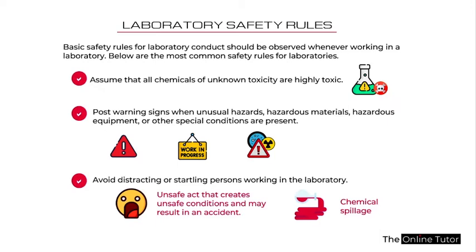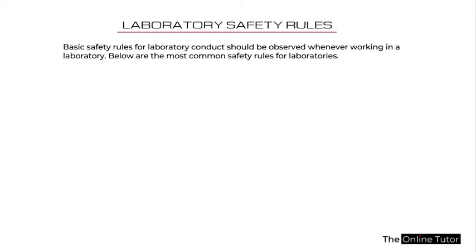Someone is holding a beaker with, let's say, an acid in it. You shout the person's name, the person gets startled and lets go of the beaker, the beaker falls down and breaks, and the acid splashes on the person. That is very, very bad. So you need to avoid shouting people's names or distracting or startling people when they are working in the laboratory. This is very, very important.